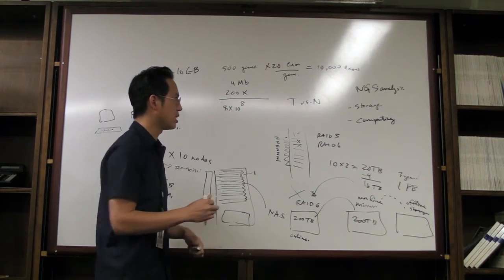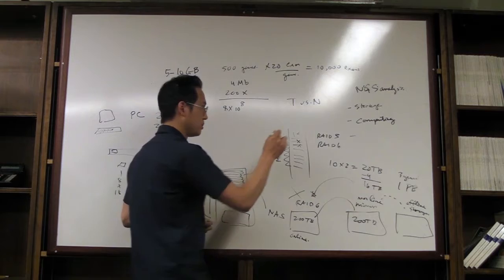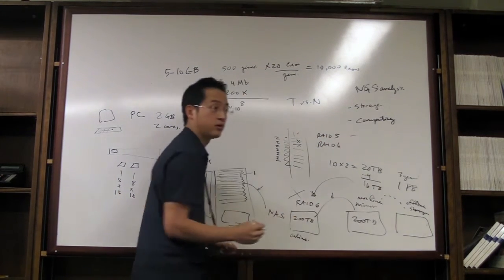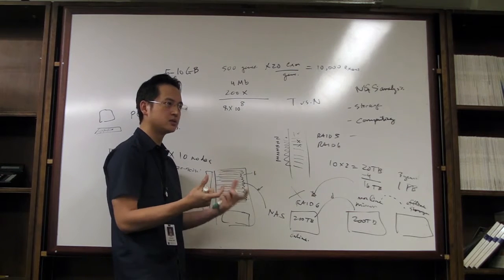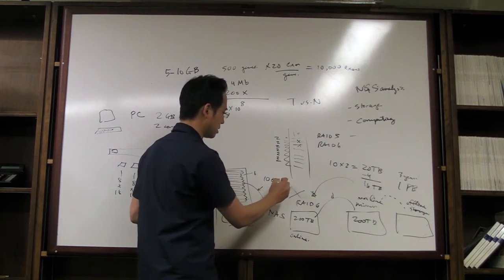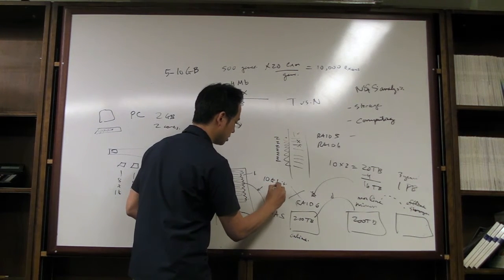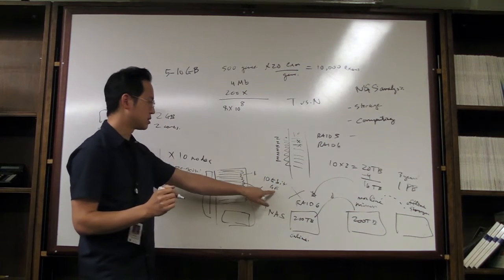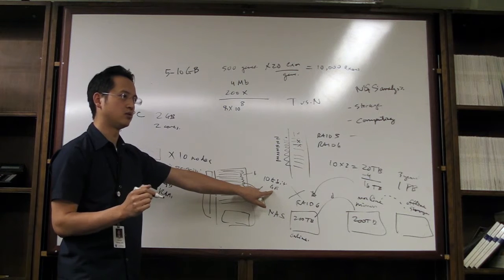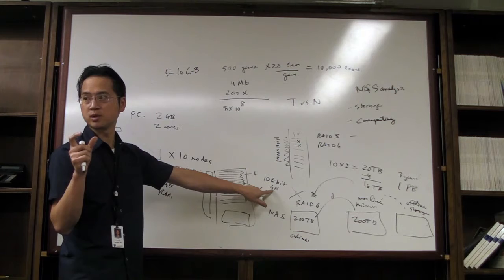But the other thing that is not apparent here is that because you're working with so much data, the pipes that are transferring data have to be very fast, right? I mentioned Verizon and all that. Here you probably want a minimum of a 10 gigabit connection. So 10 gigabit or 10 gig E connection. This is way faster than what we have here right now. Your connection right now is probably 1 gigabit, but you probably don't even get that much speed or capacity.